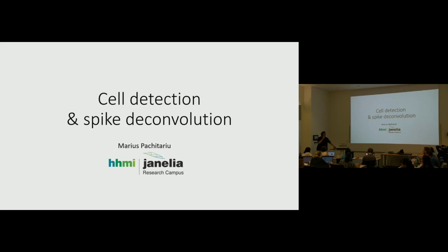Okay, so if you've gotten up to this point and you've evaluated that motion registration worked really well, as I said, your own two eyes are the best benchmark and detector, because we have these amazing visual systems that really let us see very small movements. And so if you're really happy that the registration has worked really well, now every pixel for your entire recording should represent the exact same cell, the same position in that cell, so that we can forget about motion and start to look at correlation between those pixels to try to find which ones of them go up and down together.